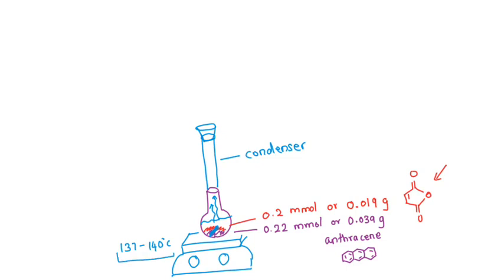You're heating, you're creating a vapor that creates pressure, and your stopper will shoot out and put a hole in the ceiling, right? So we don't want that. We want to leave it open.